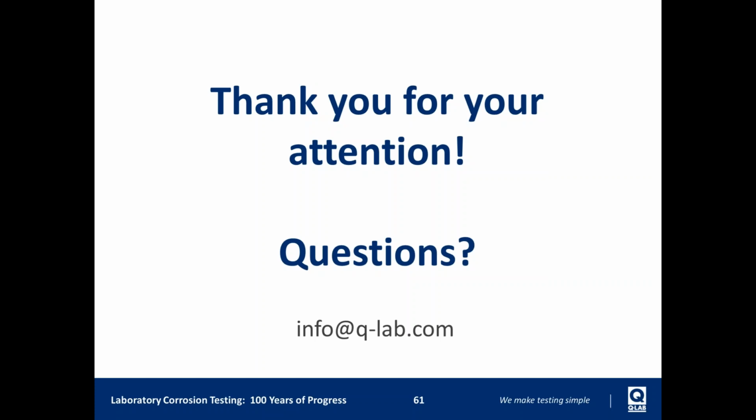It's a good question. So for GMW, a lot of it depends on the manufacturer. For us, the way that we adjust the mass loss is by adjusting the spray on-off time. The way that the test was originally run is that they would apply the salt spray in an environmental room with, say, a garden sprayer. And so there is no set collection rate that's necessary in that test method. But what we can do is set our tester to an on-off time.